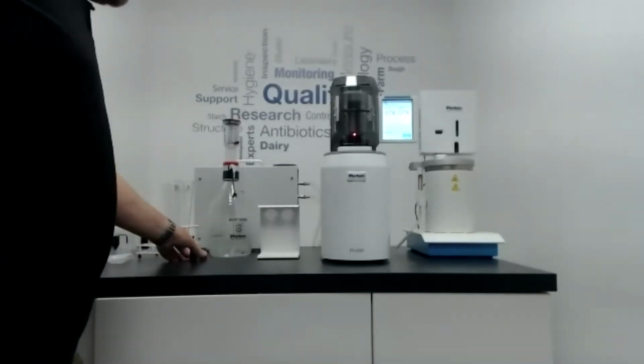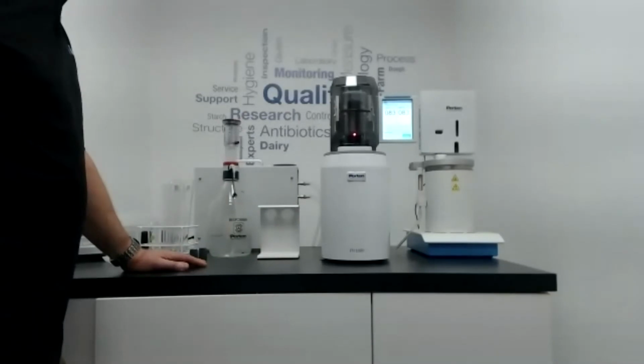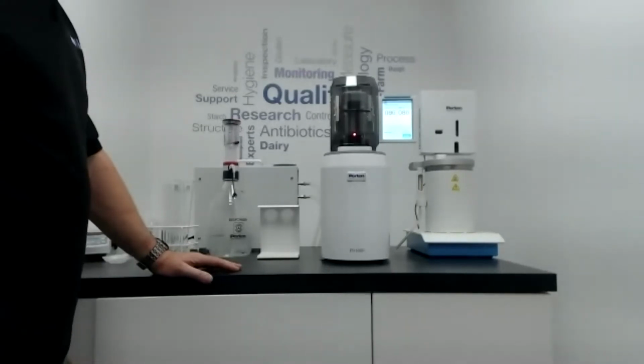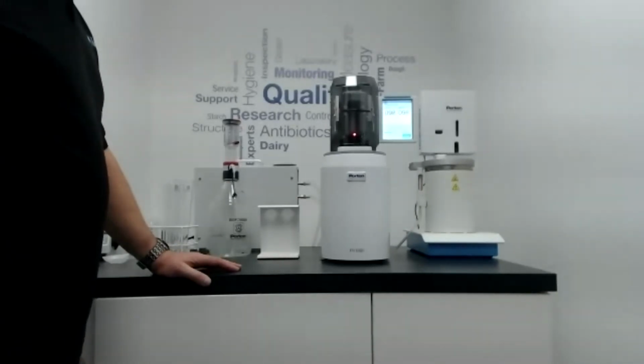The best thing to do is just put it on a bench and roll it across the bench, and if it looks straight as it's rolling, then you know it's okay. Look at the wheel at the end, it should be fully chromed. If any brass is showing through, then that can also have an effect on the results. You might consider replacing it. Okay, so this is just going to run through now.